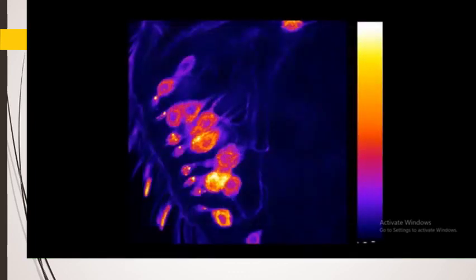In this image, the black or bluish pixels are actually low valued pixels, whereas a yellowish pixel is a very high value pixel. Now if you look at the image, you would see all sorts of colors are present. It's not that one color is present more than other colors. All colors are blended properly. So all sorts of gray levels are present. That means we have utilized the whole dynamic range, and we have imaged all the values and captured all the features of it.